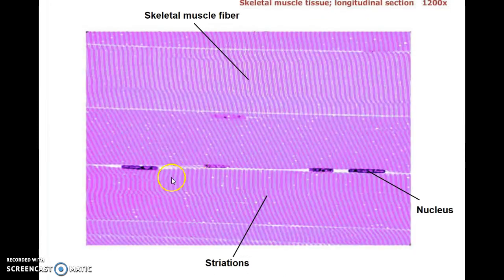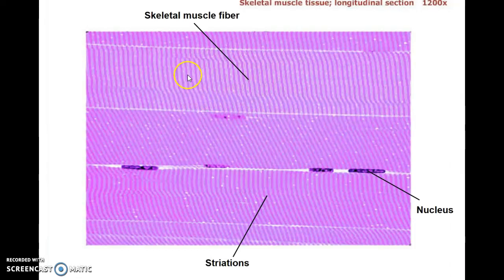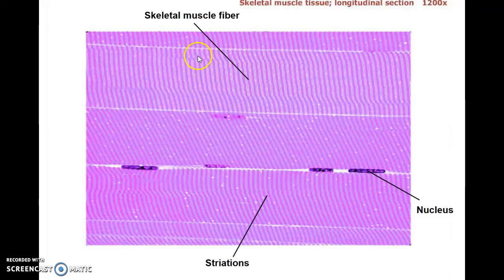Yet another slide. What you should be aware of — when I say the striations represent the proteins, it's not exactly just all the myosins and then the actins. There's subtlety to that: places where actin and myosin overlap and don't. You can look up and learn all the H, A, and I zones, but I'm not that concerned about that — just that you can appreciate what you're seeing is the shadow of all the proteins lined up, running in series along the length of the cell, alternating actins and myosins.